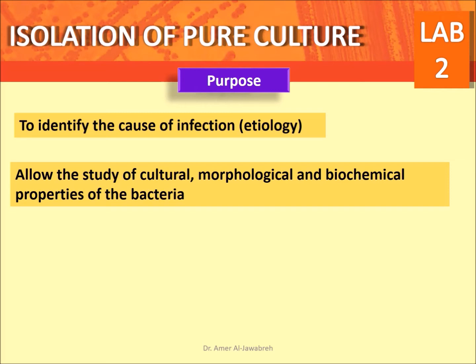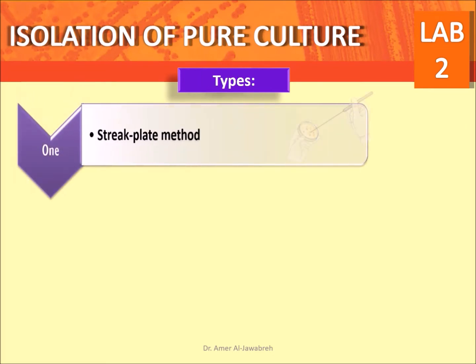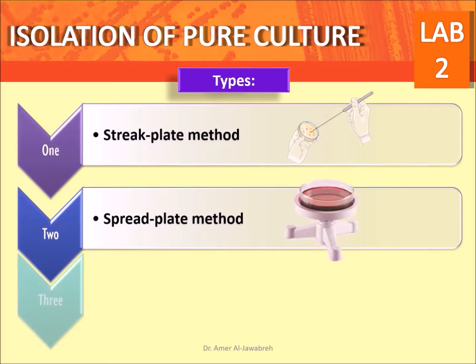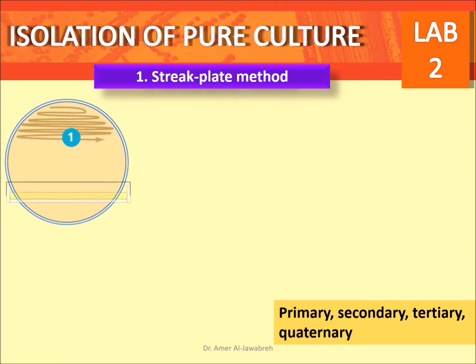Allow the study of cultural, morphological, and biochemical properties of the bacteria. Definition: pure isolation is producing sufficiently far apart individual bacterial cells on the surface of agar medium, containing only one type of bacteria. There are three methods to isolate colonies. First, streak plate method. Second, spread plate method.